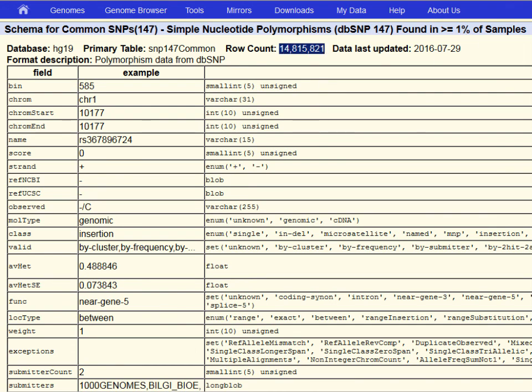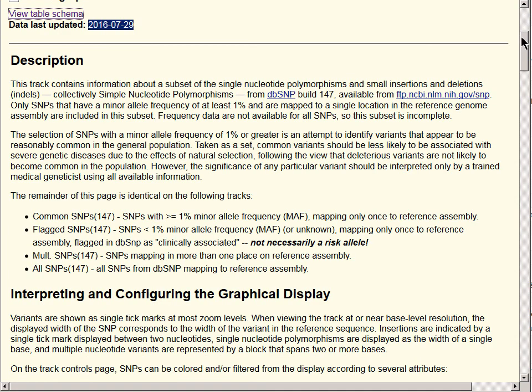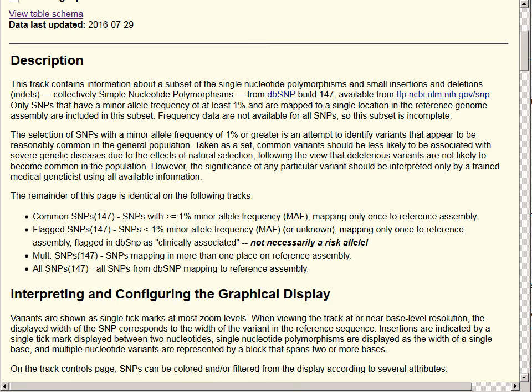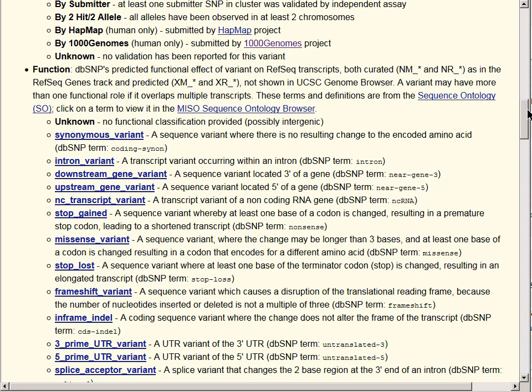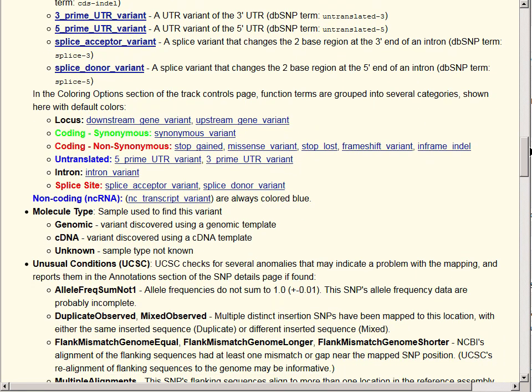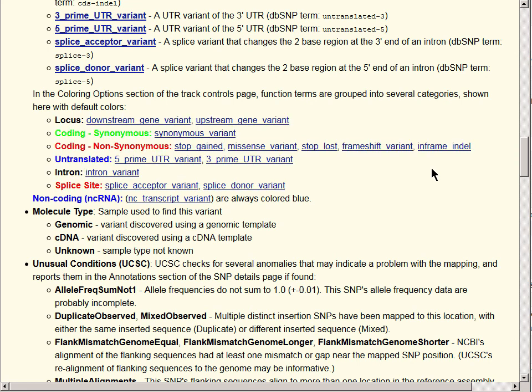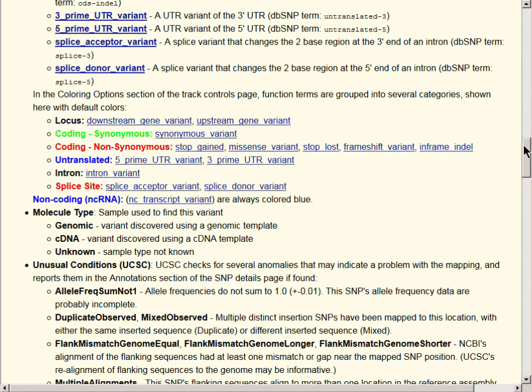Each of the SNP tracks, and indeed all tracks on the browser, has a description that gives details about the construction and interpretation of the track. You see here that the four tracks are described, as is how they relate to each other. There is a large amount of other information on the description page, including interpretation of the color scheme: SNPs in the flagged SNPs track are red because each variant is likely to disrupt the protein — coding non-synonymous, such as missense or nonsense, or splice site variants. Green is coding synonymous, and black and blue are not in protein coding regions.